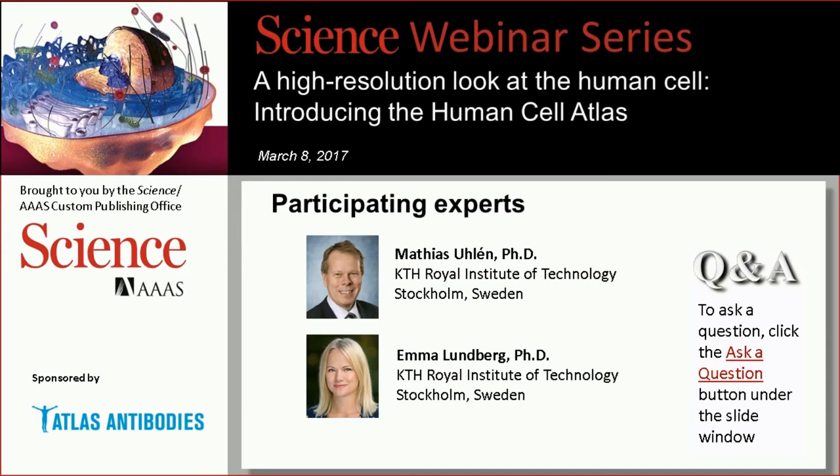Yes. The signal intensity, which is what we measure from the antibodies, depends on many different things, including the affinity of the antibodies and how many epitopes you're recognizing, and so on.